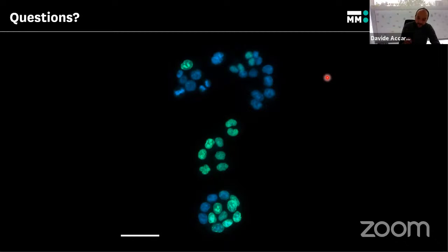So in fact, the magnifying factor in the lens is fundamental when you have a detector, like a camera with fixed pixel size, because by changing the magnification factor, you change how big the image of your sample is that you project on your chip. And this will increase the sampling factor and therefore the resolution, until you might eventually get the optical resolution that is theoretically predicted with the Abbe formula. So this is very important.